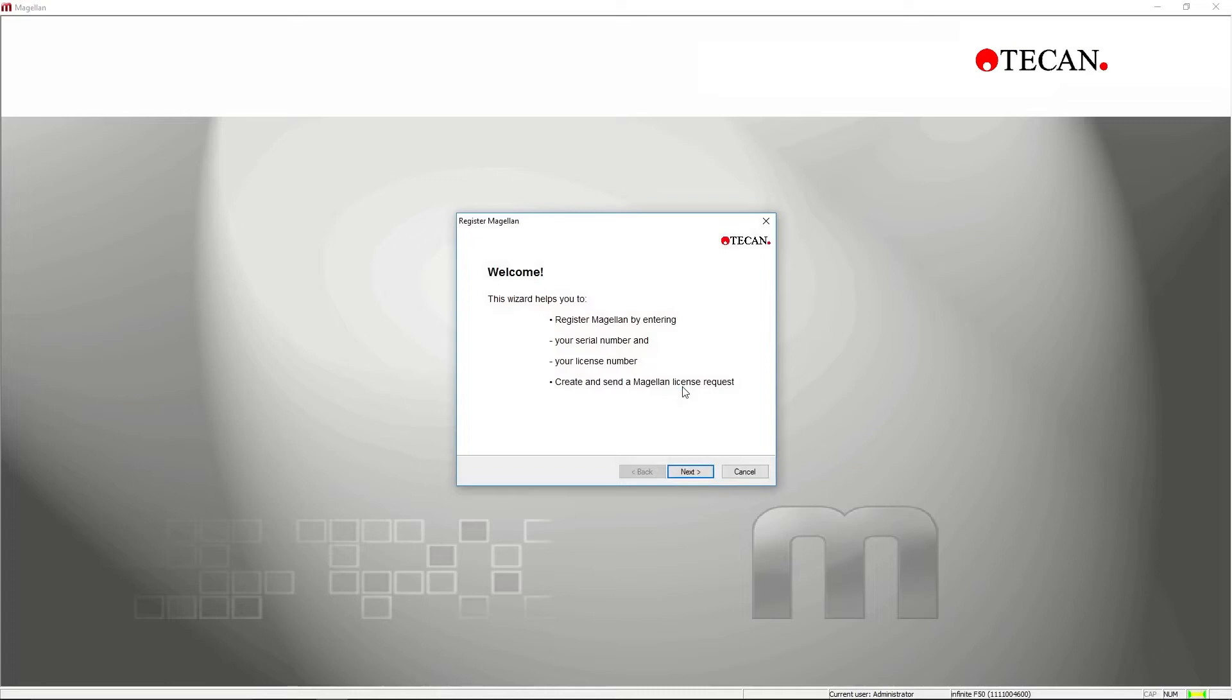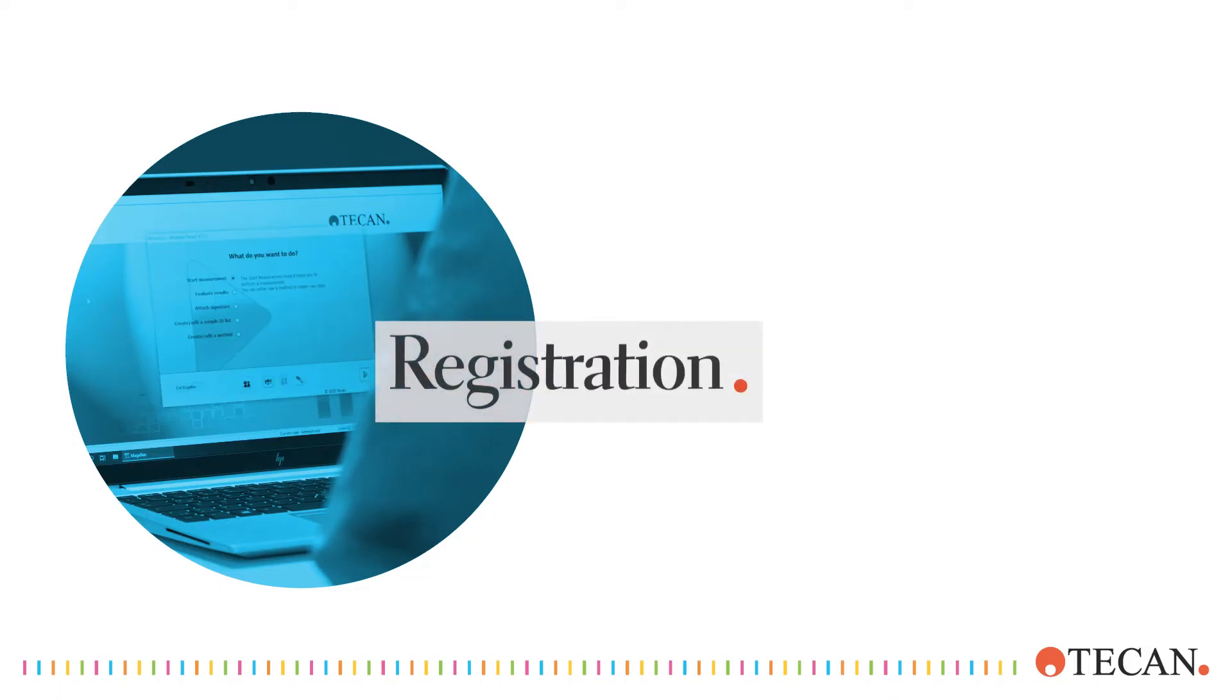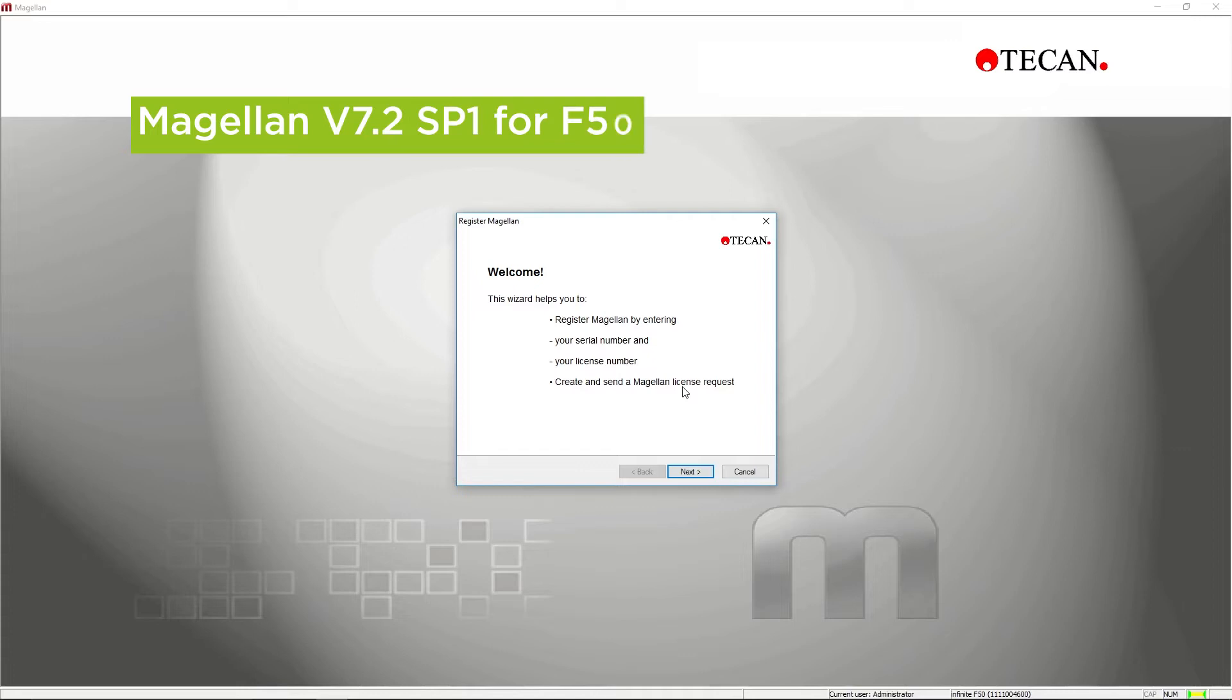To have full function of the Magellan software, you need to register it. Note that Magellan version 7.2 Service Pack 1 for F50 is the dedicated version for the Infinity F50 and doesn't need to be licensed.